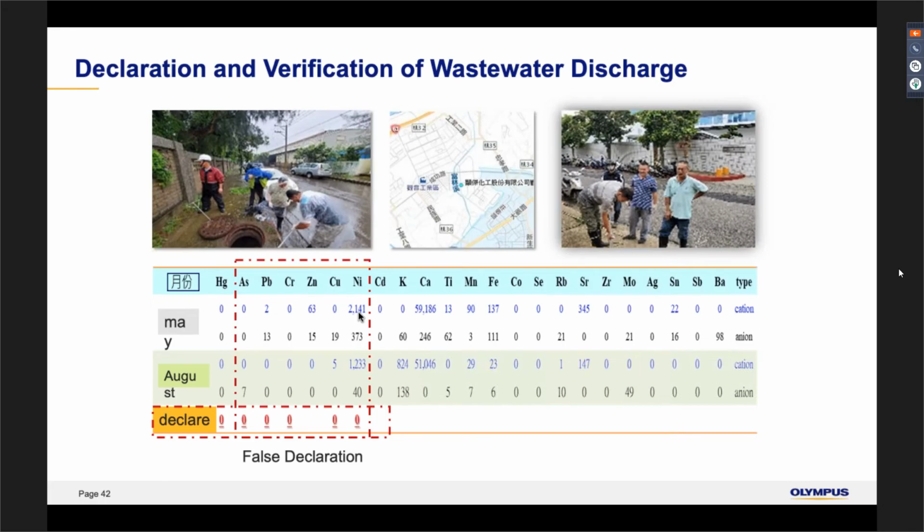Yeah, so just to share a little bit with everyone, as Prof has mentioned, handheld XRF is already commonly used in many countries by the EPA itself for soil environmental testing. So you can directly use the XRF to test the soil samples to find out what the contamination or the elemental concentration is.